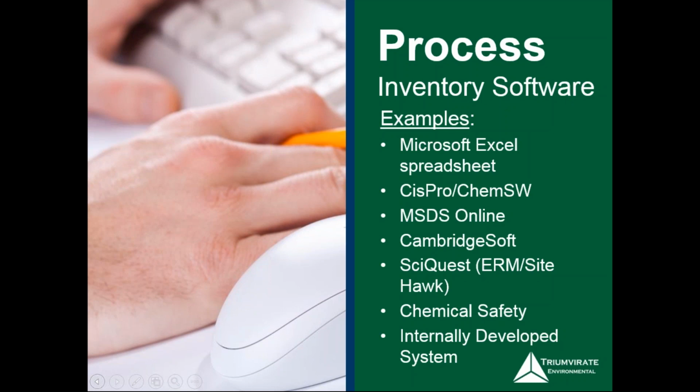ERM in particular I've worked with quite a bit, and that one's really good for procurement management and linking up with things like Oracle. So if you're really looking for that procurement link, that could be a good option for you.